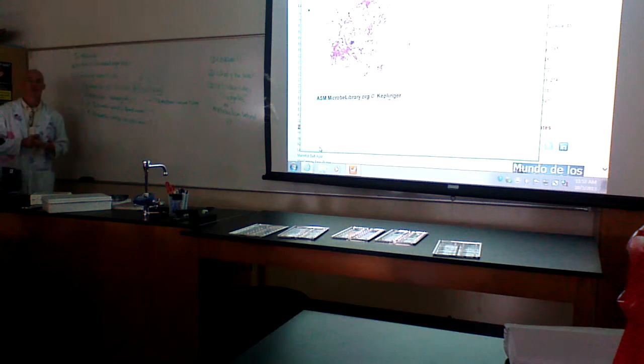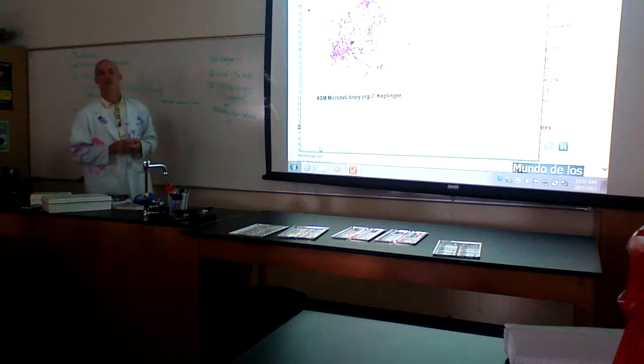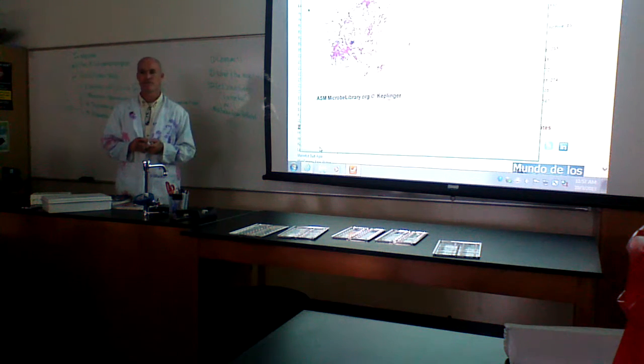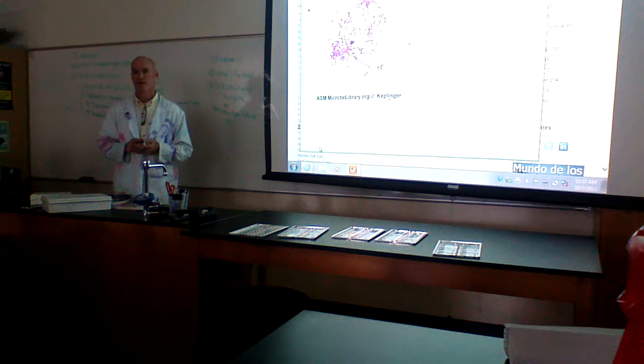Can you spell that? Nocardia. Can you spell mycobacteria? M-Y-C-O bacteria. So if on the practical we were to look at that, hypothetically, how would we be able to tell whether it was mycobacteria or Nocardia? You could not. I would never expect you to, I would just expect you to say it would be either.